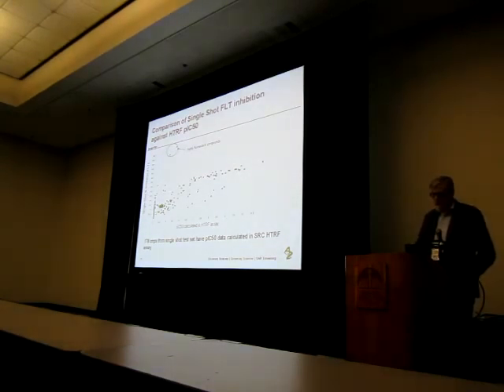There are obviously a couple of outliers, and again, when you go back and look at those two at the top left-hand corner, they are a couple of the very highly fluorescent compounds, and that's why they sit in that outlying region.